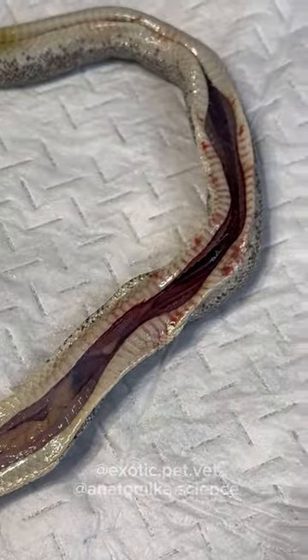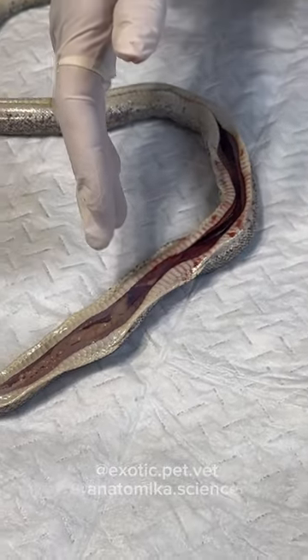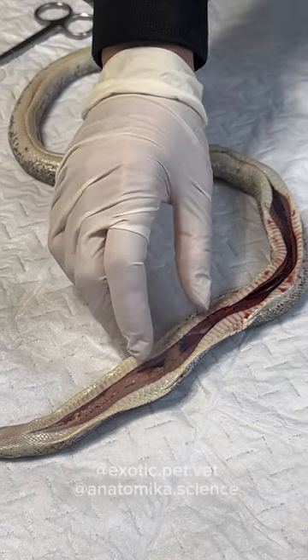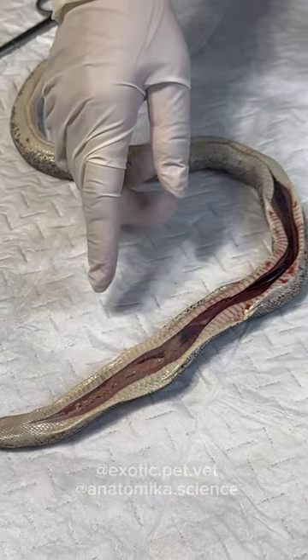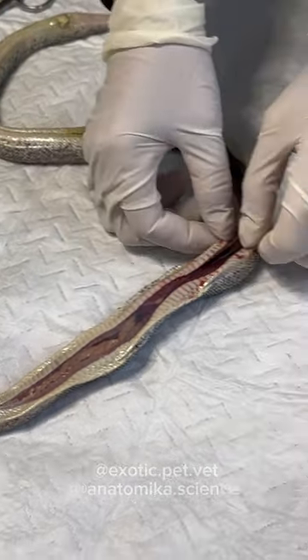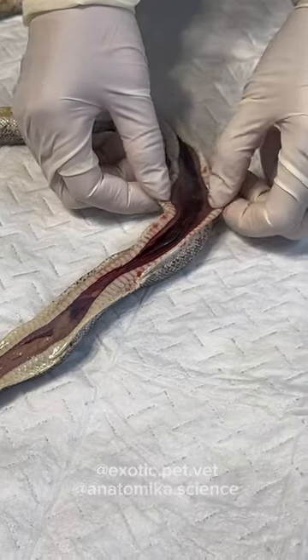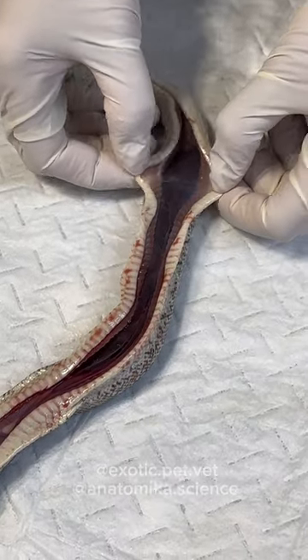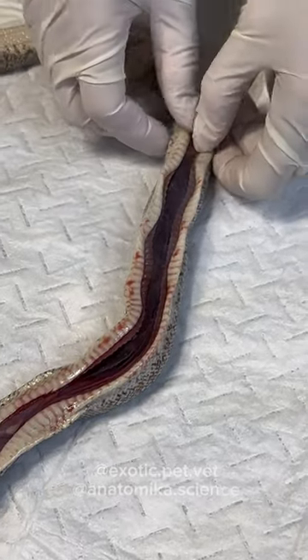With snakes, in my experience, babies will have fat above the heart as a normal condition. But in adults, that's a sign of pretty intense obesity — it basically means they've run out of space down in the last third of the body.